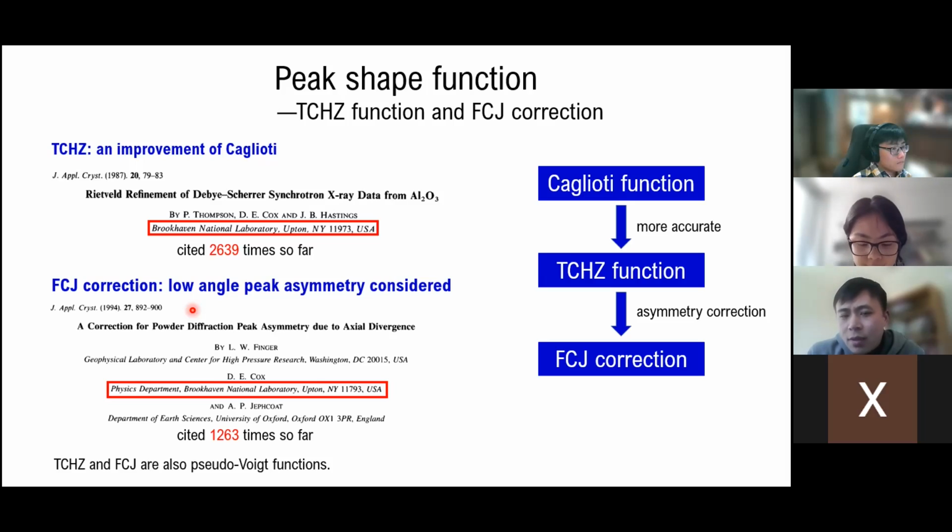But Brian Toby himself is also very serious and very responsible, because he had a lot of excellent discussions on the accuracy of Rietveld refinement. For example, people have been using their Rwp value, Rp value a lot, right? People sometimes show, "I have a very small Rwp value, so you see how excellent my fitting is," but it may not be the real case. And so he has a lot of very honest and insightful discussions on those.